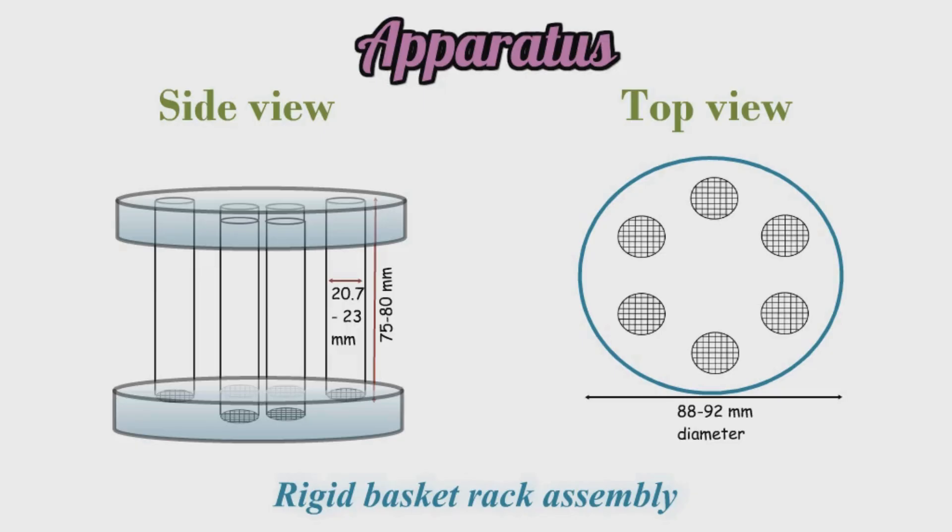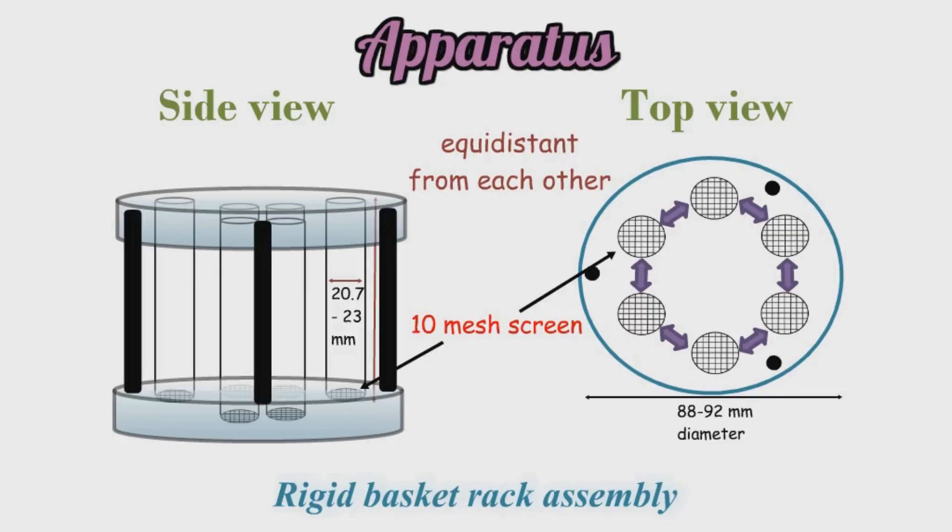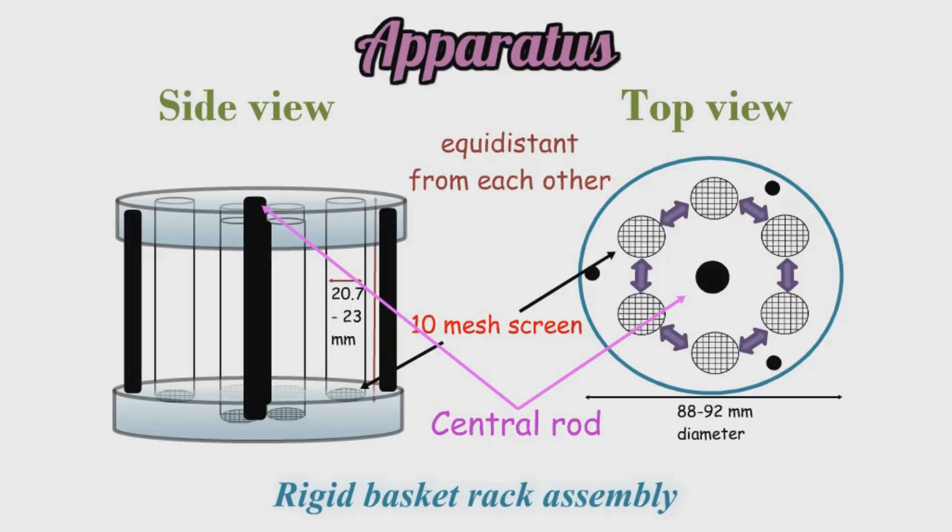These holes are placed at equal distance from each other, making them equidistant. At the bottom end of these tubes, there is a ten mesh screen — that means it has 10 holes per inch as per IP. The top and bottom plastic plates are connected by three metallic rods at the periphery and one metallic rod in the center, which is connected to a mechanical device that moves the basket up and down for the disintegration test.